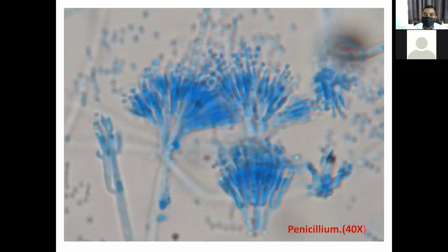A piece of tape is gently laid over a portion of the fungal colony and slowly lifted to remove an area, placed in LCB on a microscope slide, covered with a cover slip and examined. This is the instant slide culture technique.